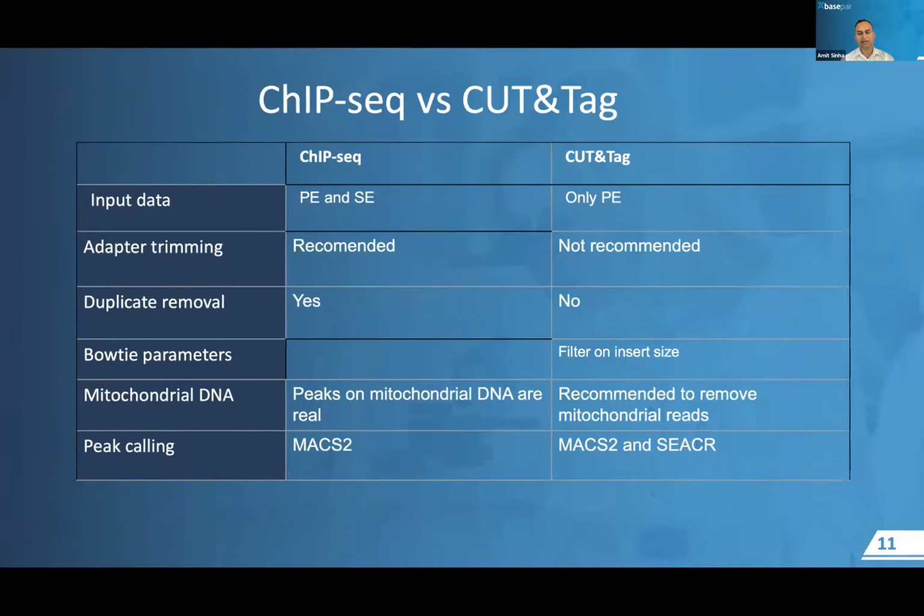And coming to peak calling, MACS2 has been one of the most standard tools for epigenetic data sets, developed by Shirley Liu's group at Dana-Farber. Although with CUT&Tag, the Henikoff group itself has developed a new tool called SEACR, which has been optimized for CUT&Tag and CUT&RUN type analyses.